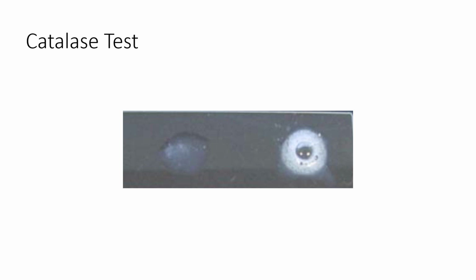The Catalase test. The Catalase test tests for the presence of the enzyme catalase. Catalase is an enzyme that can break apart the toxic hydrogen peroxide that can be produced as a waste product or byproduct from cellular respiration. So hydrogen peroxide is a bad guy. Cells don't like it. If a cell is able to use oxygen as a terminal electron acceptor in that electron transport chain, chances are it's going to end up producing this hydrogen peroxide. And if it produces it, it's got to have a way to break it down. So it's also going to produce that catalase enzyme to protect itself from damage from that hydrogen peroxide.